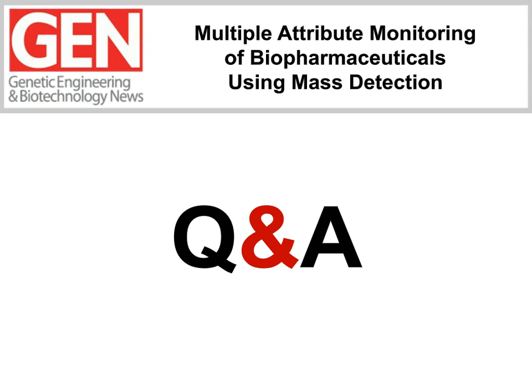In terms of RapiFluor, does it have to be used with the QDA? Absolutely not. The benefits of using the RapiFluor MS span across all of the different fluorescence or MS detection options that are available. And that ties very well into the last part of the question, which is the performance of the reagent on other MS instruments.